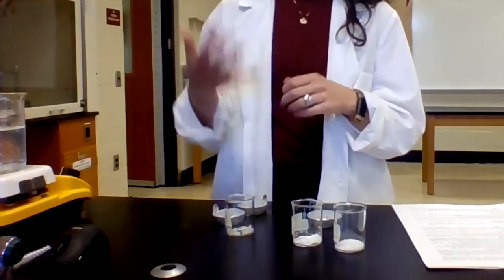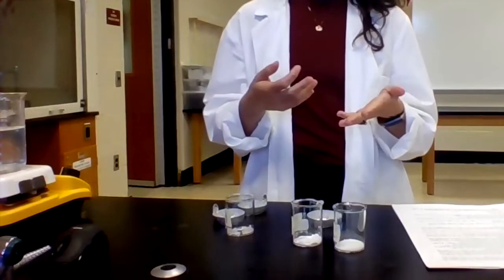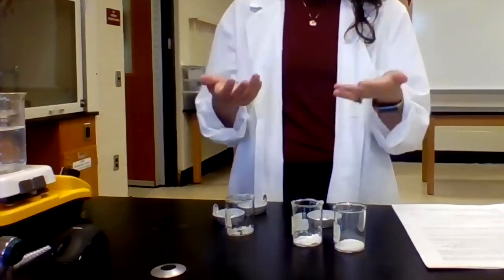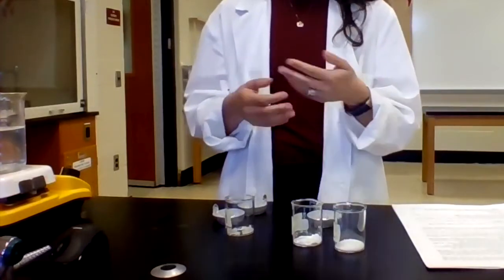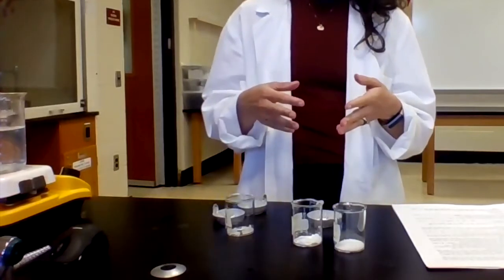Polar covalent because you have stronger intermolecular forces. Ionic has a high melting point not because of intermolecular forces, but because you would have to break the ionic bond in order to melt an ionic compound. So I'm going to test for melting point a couple of different ways.